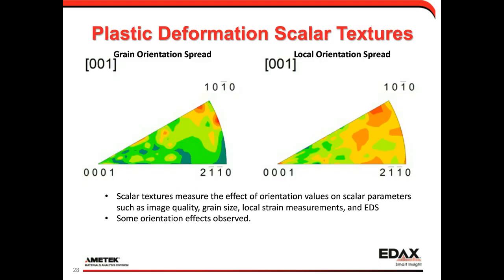One question worth asking is whether metrics like Grain Orientation Spread and Local Orientation Spread can be correlated with orientations — that is, are certain orientations going to deform more easily than others? We can look at this as a scalar texture, examining texture effects on different parameters. Showing scalar textures on the GOS and Local Orientation Spread values, we see a few hot spots in the distribution indicating that some grains are deforming more than others due to orientation effects.